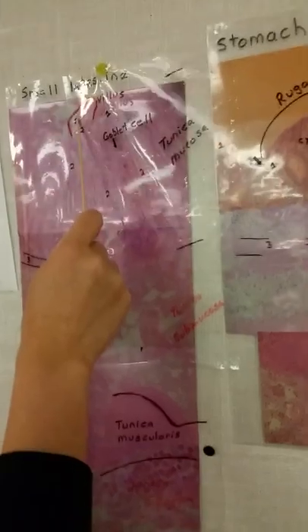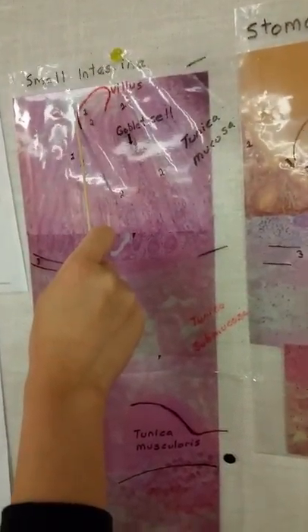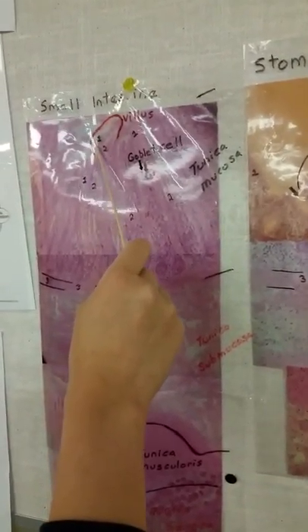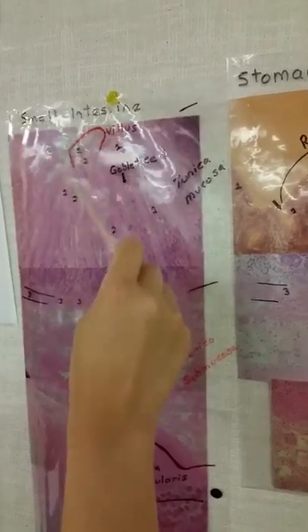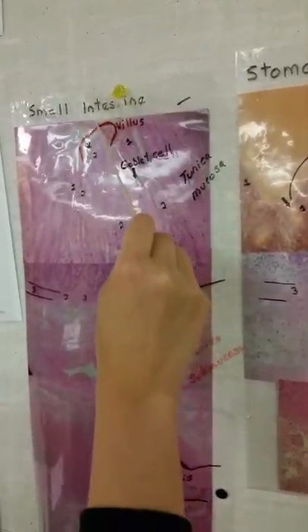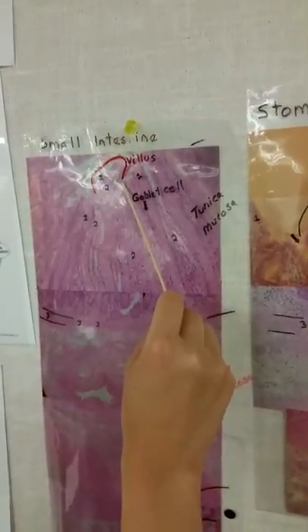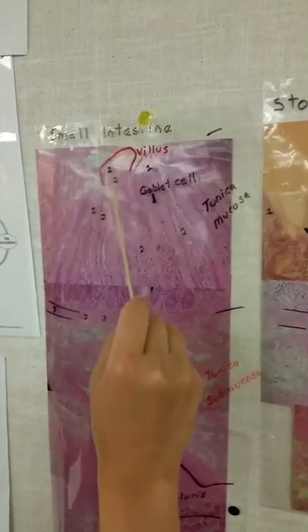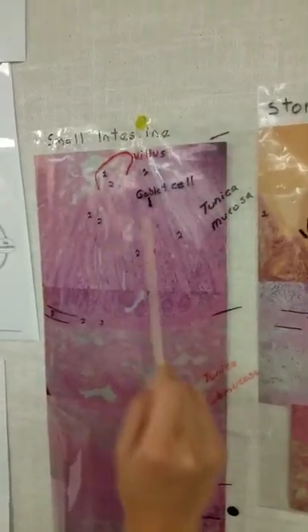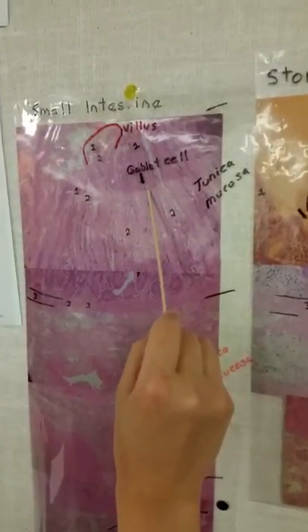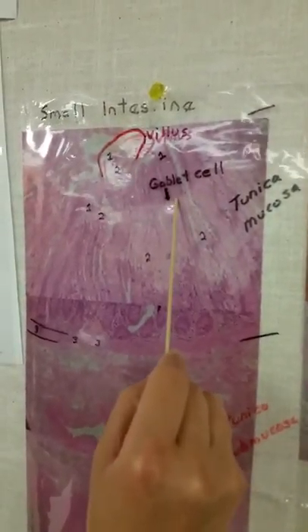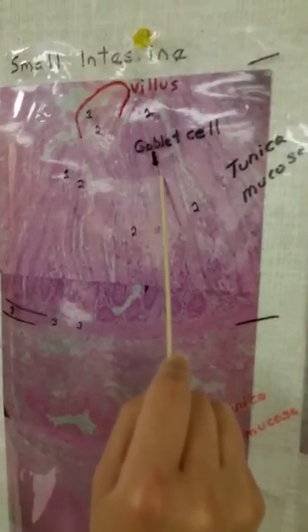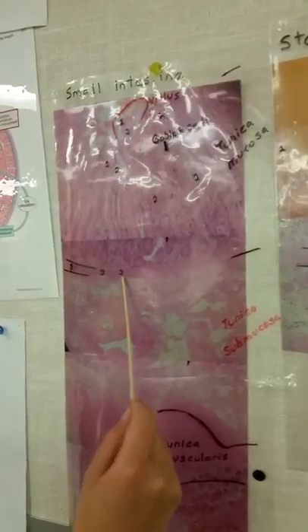This is the simple columnar epithelial tissue, non-ciliated. This part here is the villus. This is the connective tissue. This is the goblet cell — goblet cells are these little circles here. Muscularis mucosa would be here.